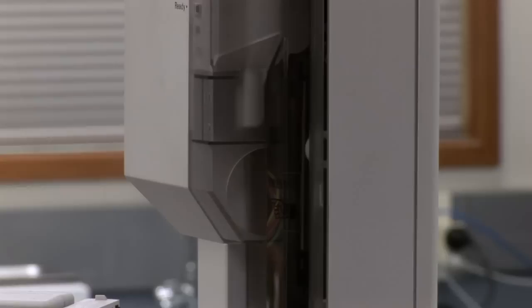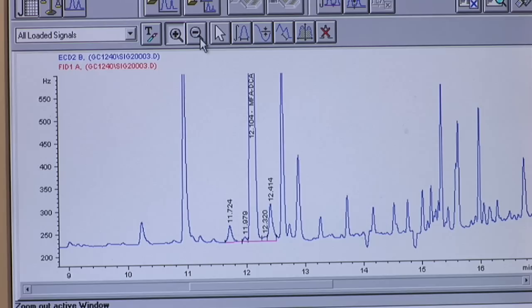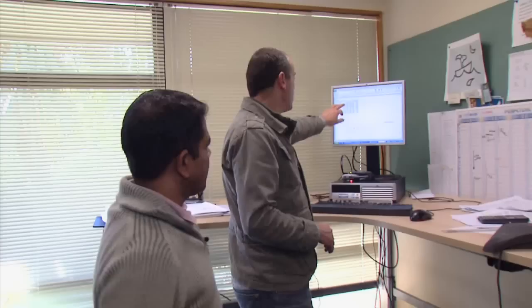It'll just repeat this whole process until it's run through all of the samples. And the size of the peak corresponds to how much 1080 is in the sample. These are the results that will go to the NIWA scientists. I've just done the calculations now. Okay. It's really interesting. Most of the 1080 appears to be just going into the soil.